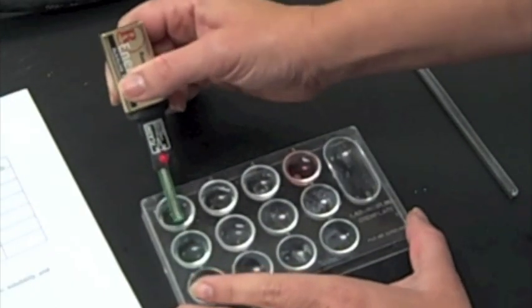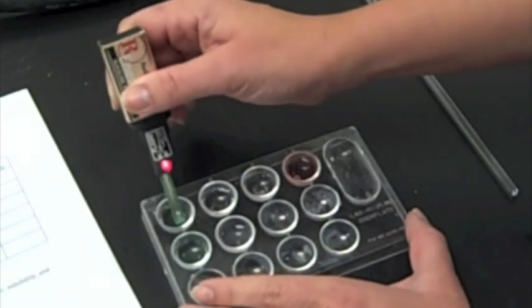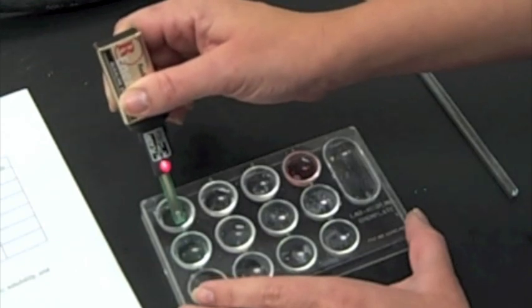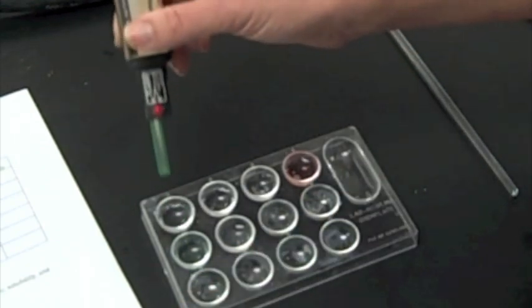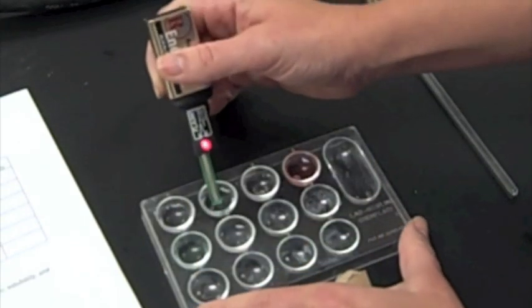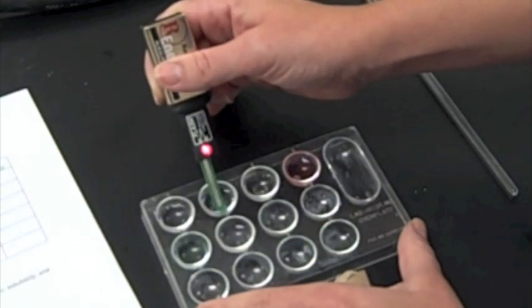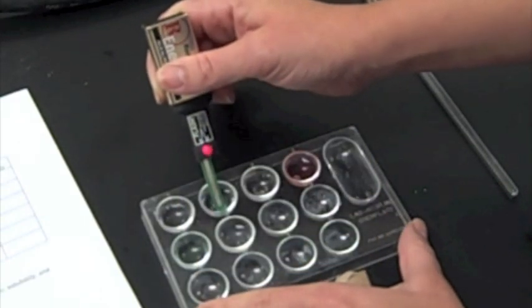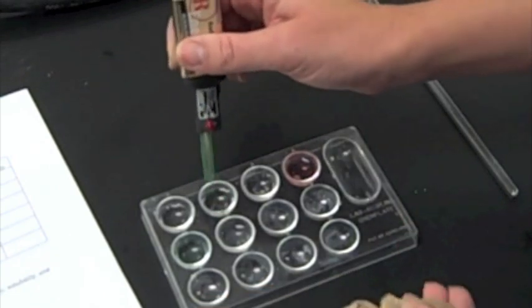Alright, so first up is sugar. Put it in the water, nothing. So, sugar is not conductive. Put it in the salt, and there's a positive test. So, salt water is definitely a conductive solution.